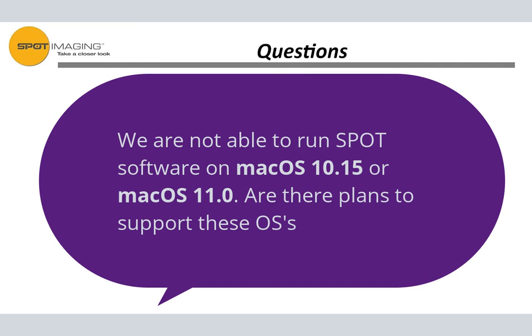Question: we are not able to run Spot software on Mac OS 10.15 or Mac OS 11.0. Plans to support these OSs? At this time, we're in the middle of a design and development project that has all of our programmers tied up, which is the PathSuite 3 launch. Once we finish with this launch, which is right now scheduled for the first quarter of the year, that's when we'll be able to release resources to do the update for the Spot Mac software.